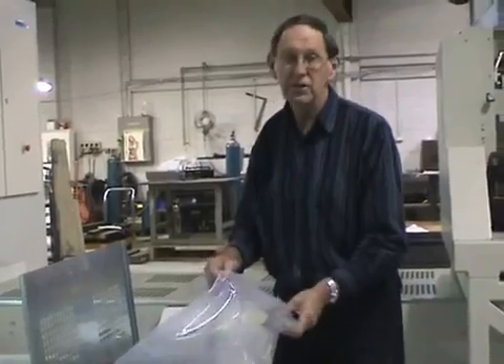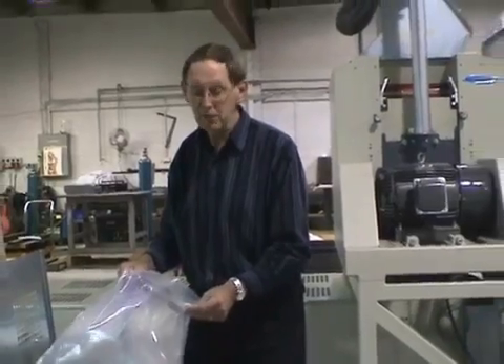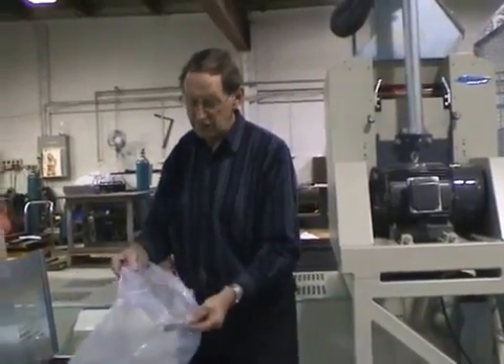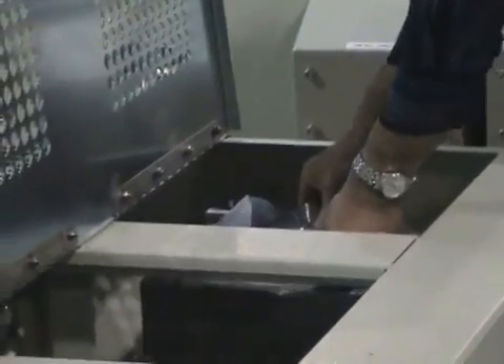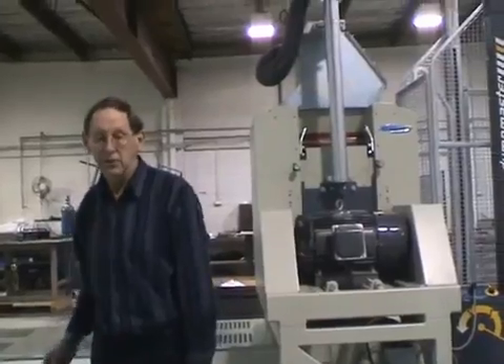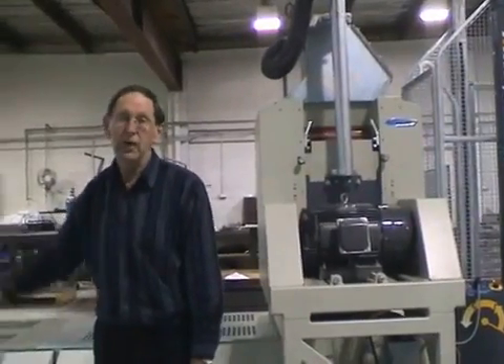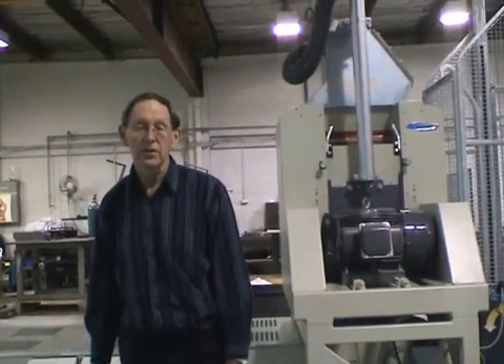Here we've got a large plastic bag which can hold twenty to thirty kilograms of sample. It's loaded into this little clip at the top and put into the sample bin. The lid is closed, and while the next sample is being weighed and loaded into the big boy sample bin lifter, this bin will now travel down the conveyor, ready to collect the first sample that's produced from the next batch of samples.